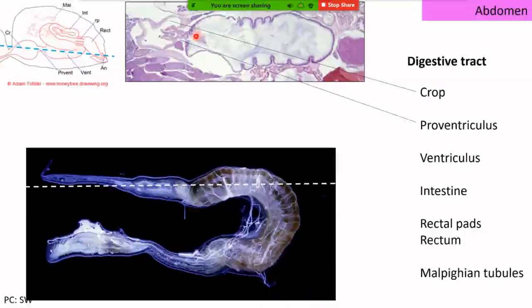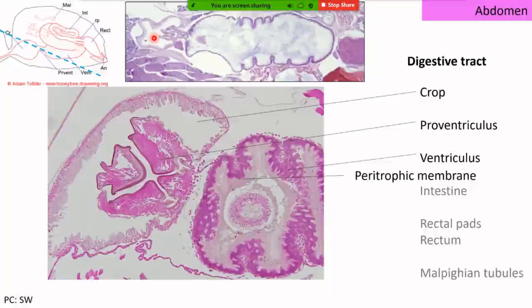You can see that this little bit of proventriculus is called the proventricular sleeve, goes into the ventriculus itself, and prevents retrograde movement of digesta from ventriculus into the crop. Now, looking more closely at it, this is more of a cross-section through the ventriculus. You can see, again, the forelips of the proventriculus and the highly undulating lining of the crop that, again, is undulating because it needs to allow for great expansion.